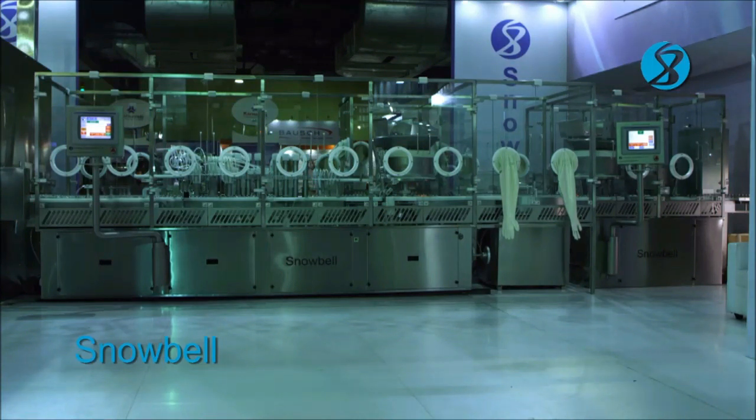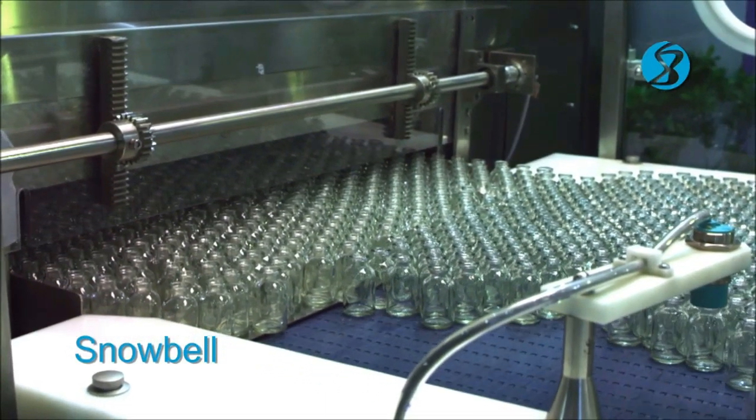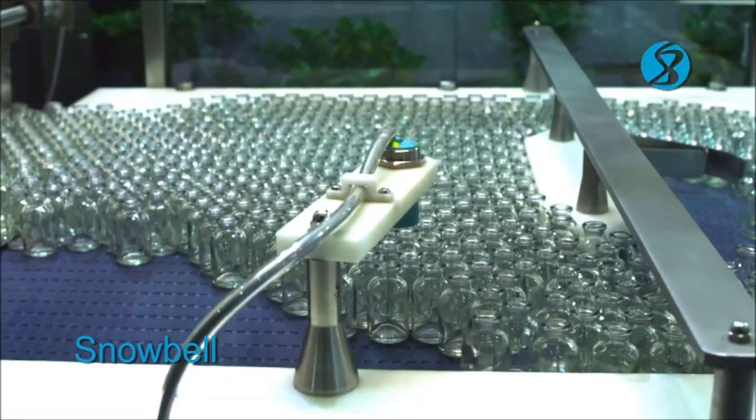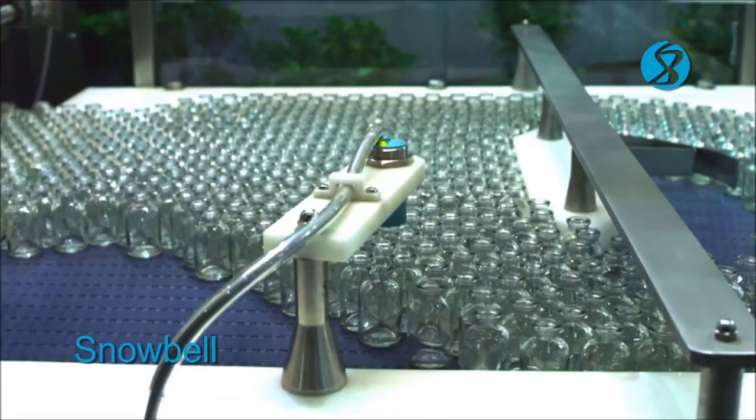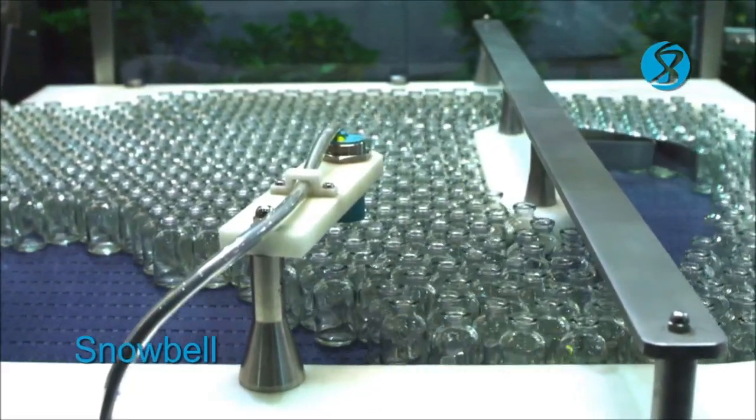Snowbell liquid vial filling and stoppering machine is a monoblock type process machine designed to fill liquids and to further carry out the stoppering operation on the filled vials. The vials fed from a linear unscrambler through one lane are carried back to back by a slat belt through the filling section of the machine.